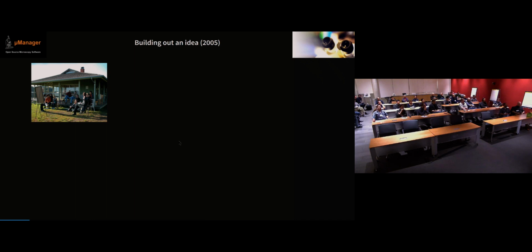And so basically, when you come up with the different strategies for software control of a microscope at that point, you can write something completely from scratch. And there are quite a few people here who are doing that. So Loic is writing Java-based. Andy is using Python to talk directly to the hardware, do the whole thing.